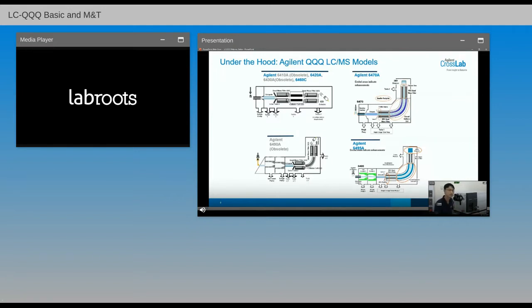We'll be seeing that in the later part of the demo. Of course, we'll be having the capillary and then the ion optics. All the ions will go through, and the selecting of the ions itself, depending on the method, which is on the software, we'll be implementing on the quadrupole.